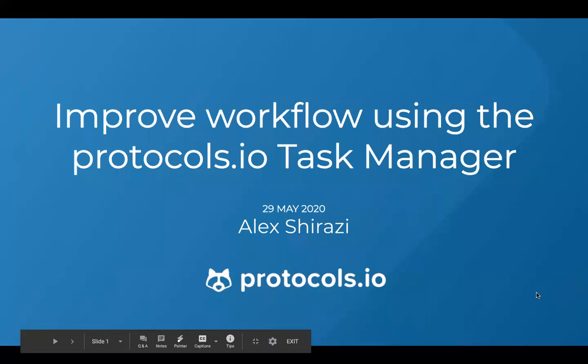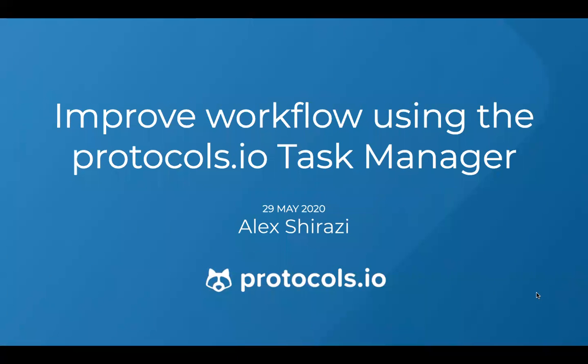Today we're going to be talking about improving workflow using the Protocols.io task manager. Some of you may not realize that every workspace has a task manager, so we'll be going through how to access the task manager, creating tasks, assigning tasks, and an example of the overall workflow.